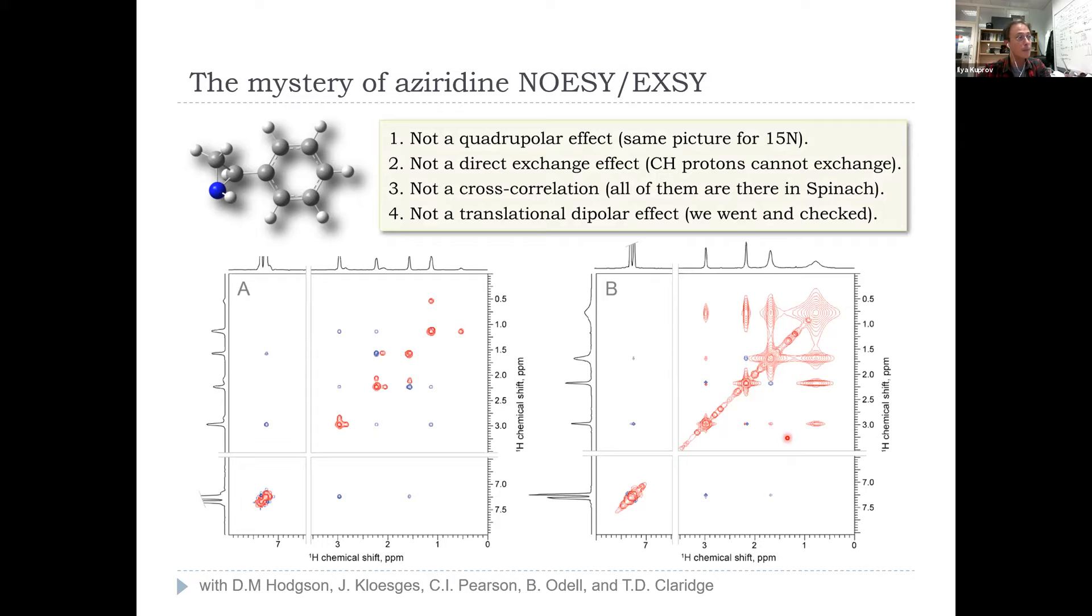But some have become positive between positions that cannot possibly exchange, like between that proton and that proton there, or this proton and this proton. We are starting to see strong positive NOEs between positions that don't exchange for the viscosities that really must compel all NOEs to be negative. So suddenly they became positive. Barbara's question was, what is going on?